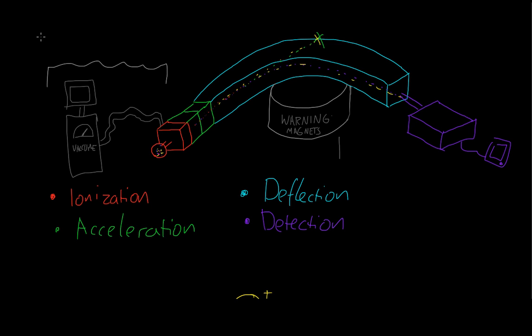At this point, the purple one is too light, so it will start hitting this wall. And we can detect the yellow one, and then we can do the same for the green. So we can change the strength of these magnets, map the currents, and produce a graph. And the graph will look something like this.